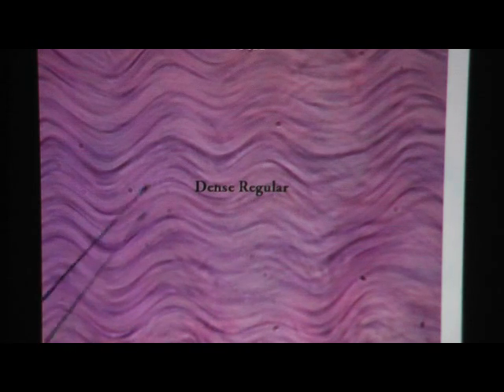This is magnified 400 times, and I hope you see the pattern of the waviness here. And then, of course, the dark stuff would be evidence of fibroblasts in between the collagen fibers.